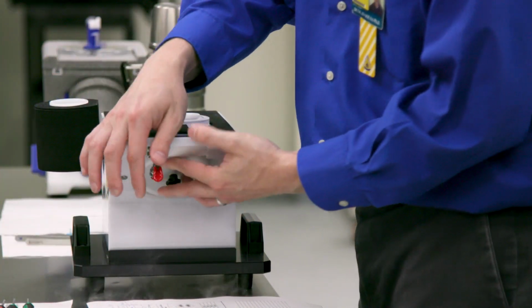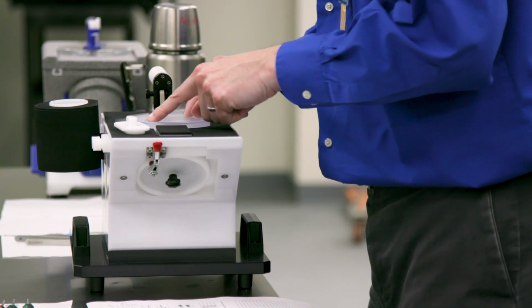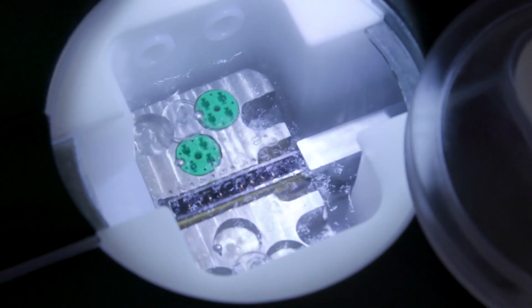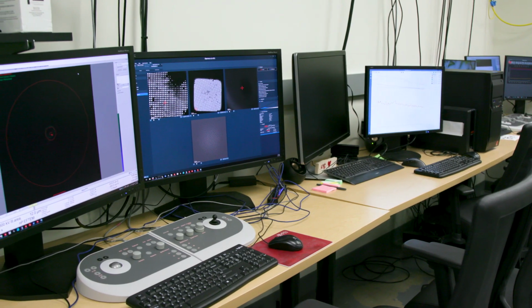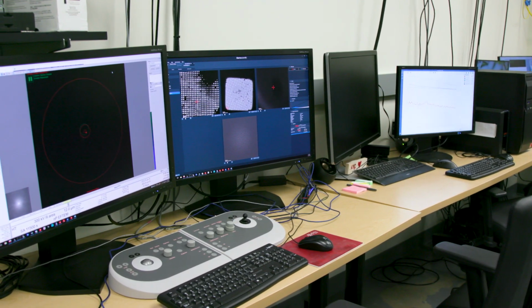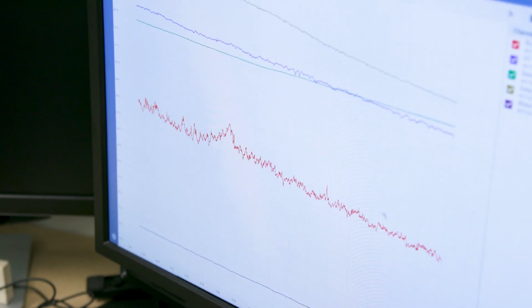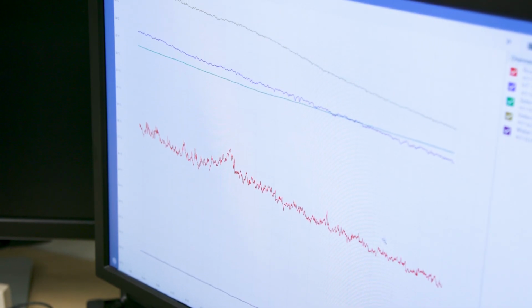With that initial investment, we've been further able now to acquire another microscope through the Howard Hughes Medical Institute for basically conducting screening studies that allow us to use our existing microscope more efficiently. And then most recently, we've been able to acquire yet another instrument which is useful for preparing samples so that you can look at molecules inside cells. It's for a technique called electron tomography. And none of this would have been possible without that initial seed funding from the Beckman Foundation.